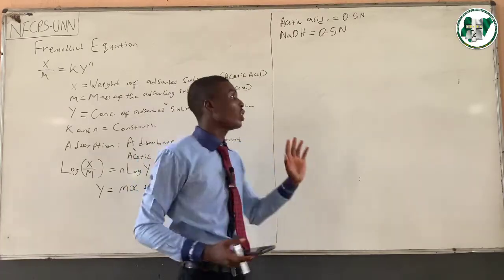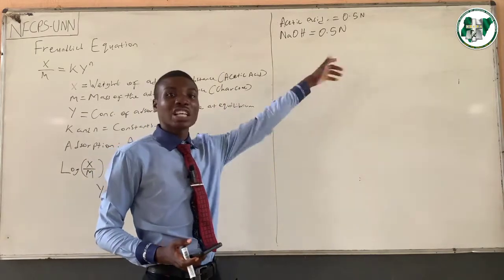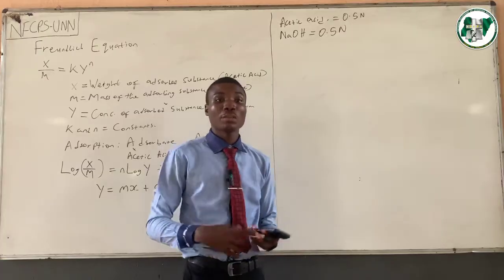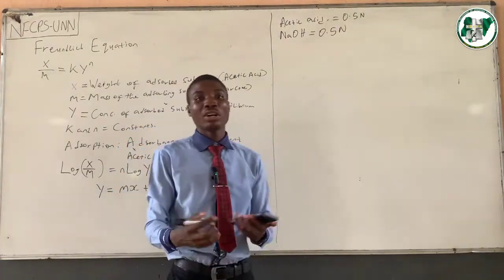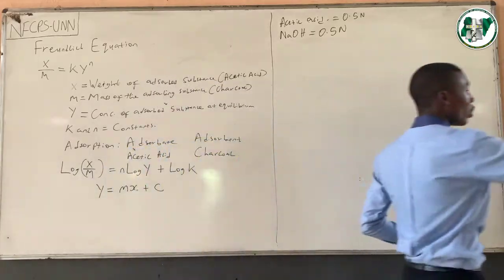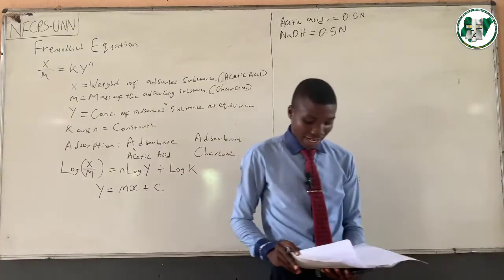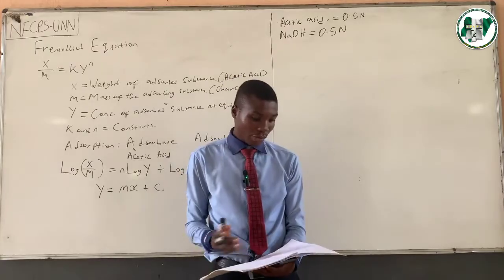Nevertheless, what you need to focus on is understanding the theory behind this particular experiment, because when you understand it, you can ace your practicals and your practical examinations. So, let's read what we have in the manual and understand the procedure, and then we can go over to the calculations. What I have right here is my manual. You can also look into yours and we'll go through the procedure together.